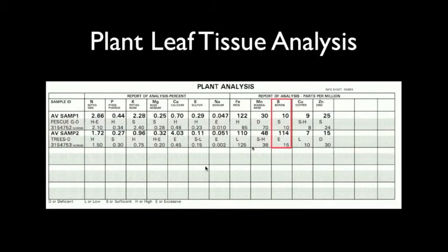The idea is to balance these, certainly with the micronutrients. You want to balance them. So we would like to see either an S or an H in all of these categories rather than all of these peaks and valleys between the different elements. It's called nutritional balancing. It's necessary for good health of individual plant species, especially trees, because they can't respond in the rapid way that turf can. Okay. Because of the root mass ratio.